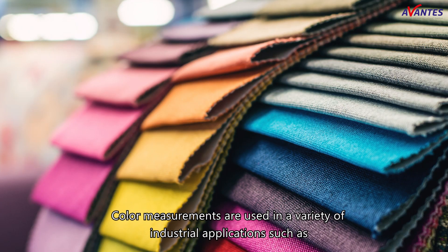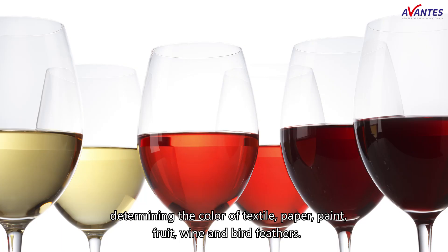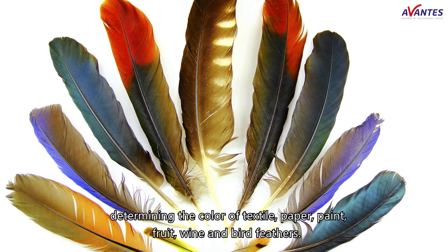Color measurements are used in a variety of industrial applications, such as determining the color of textile, paper, paint, fruit, wine, and bird feathers.